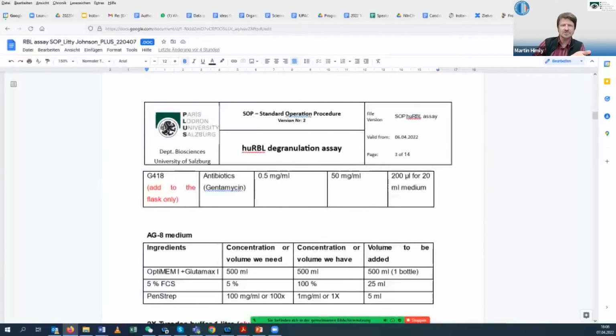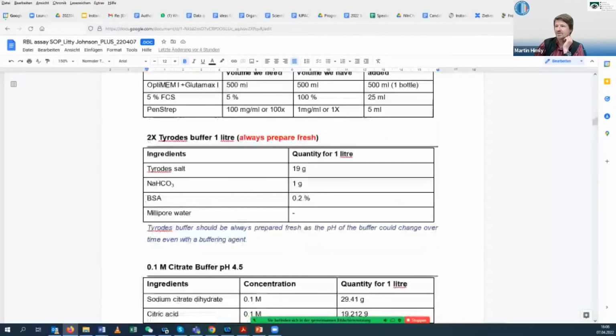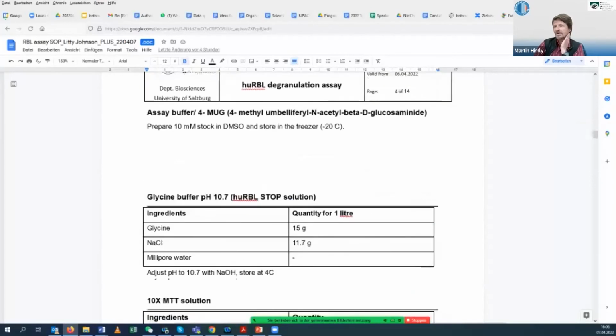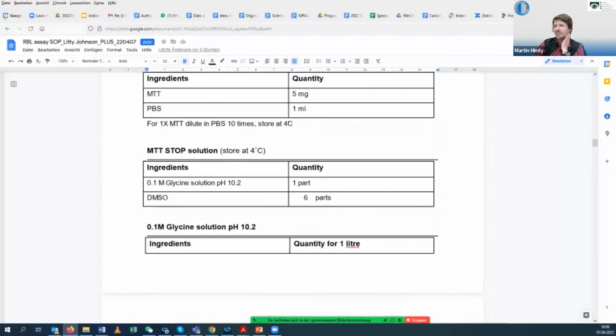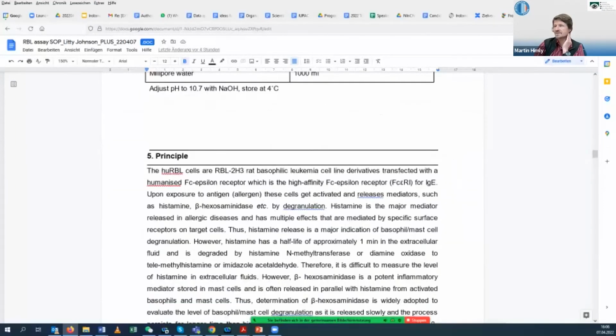And while we were discussing in this co-development phase with the other people, a couple of other points came up, which we have meanwhile integrated into this preparation phase, as they are quite relevant. I would like to highlight just one while I'm scrolling. There are lots of materials, of course.